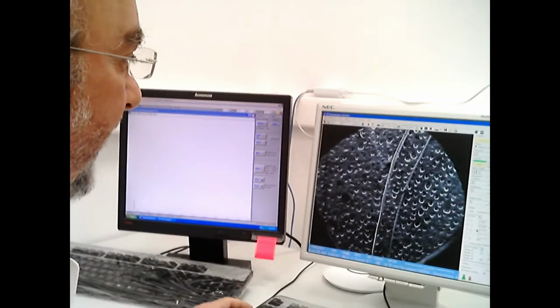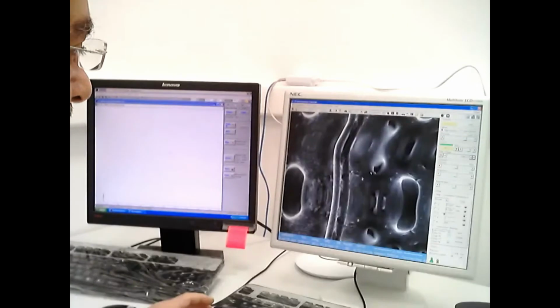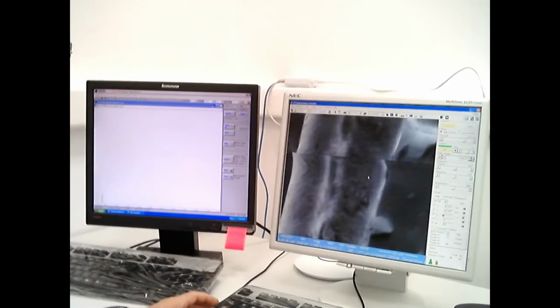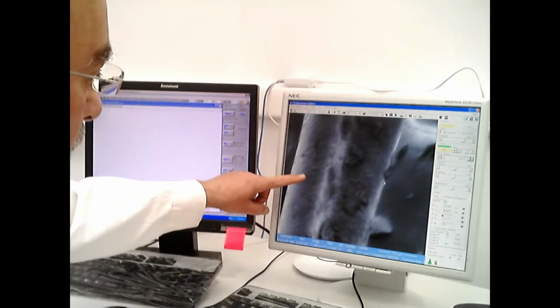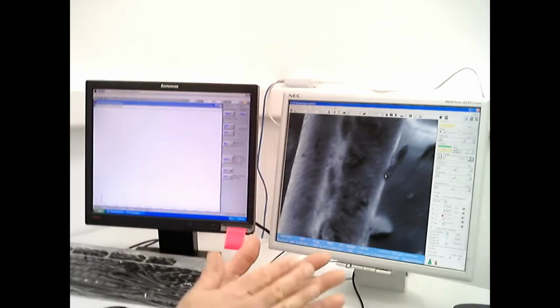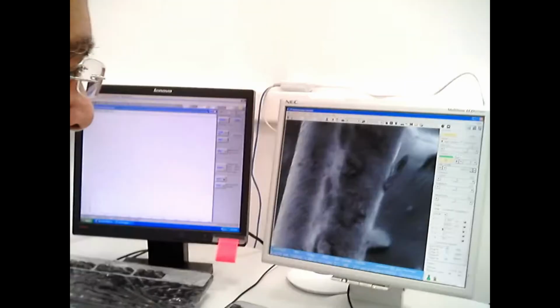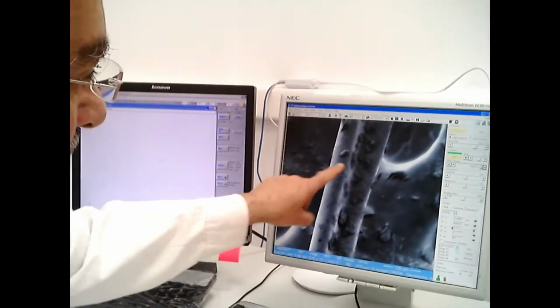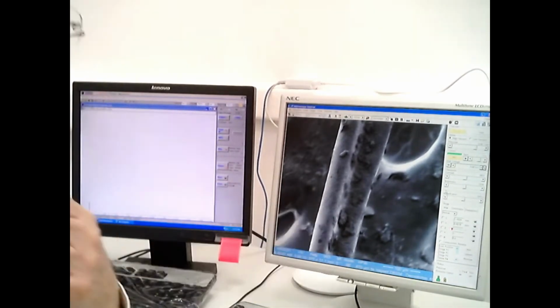This is actually a human hair, and if you go to high enough magnification, it has particular striations. You can see that this human hair consists of scales on top of one another. This is a double hair, which is very interesting. Nearly always a double hair like this, in other words, 2 or 3 hairs stuck together, usually comes from a beard. And this comes from my own beard, actually. So this is a very good piece of evidence.